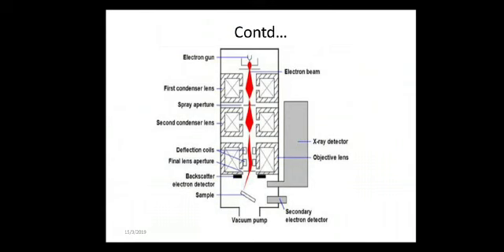It is also used to examine the microchips of computers, and it is an essential research tool in the fields of life science, biological aspects, as well as in metallurgical studies, as I said, medical fields, and forensic reports. In the case of forensic science, we can use these scanning electron microscopes.